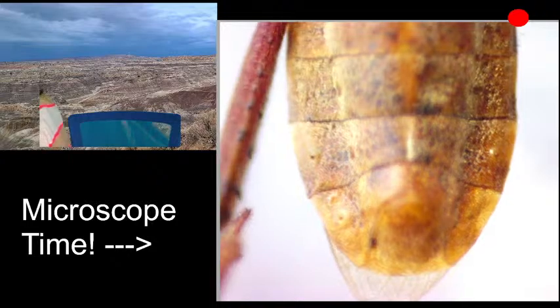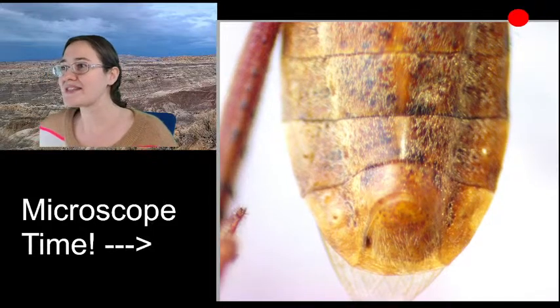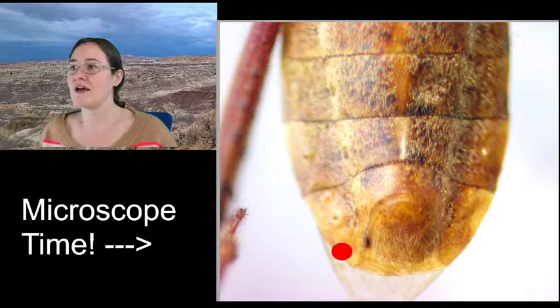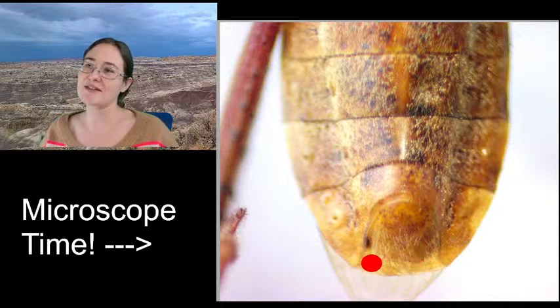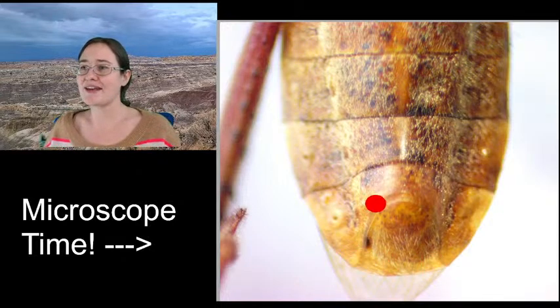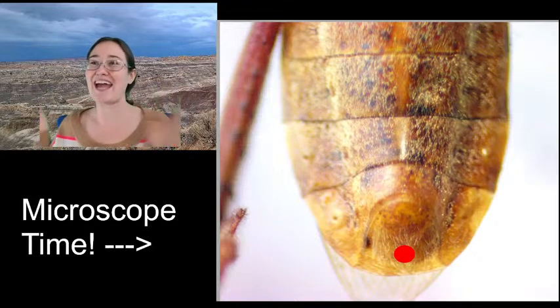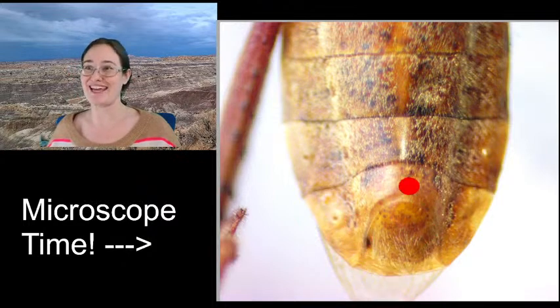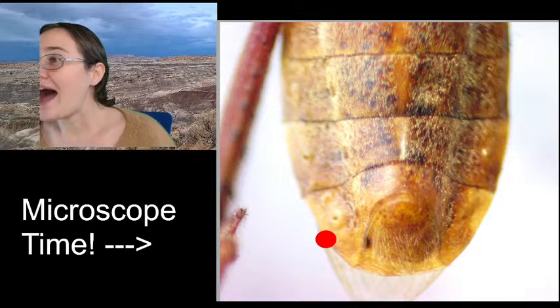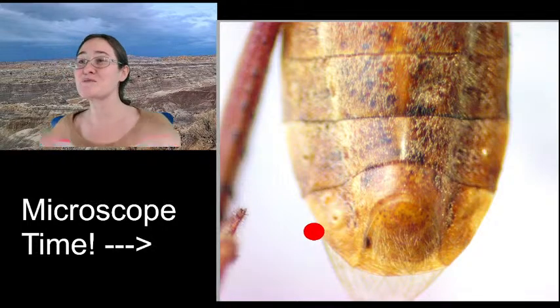I'm going to say I believe this specimen is male, because a lot of times in male specimens, you've got one large singular plate at the end of the abdomen, whereas in female specimens, you'll have two or three smaller triangular plates down here that have the ability to kind of open up, right? Whereas the males are going to have kind of one larger plate. Wink, wink. Okay. The other thing that we can see from this view are the spiracles.